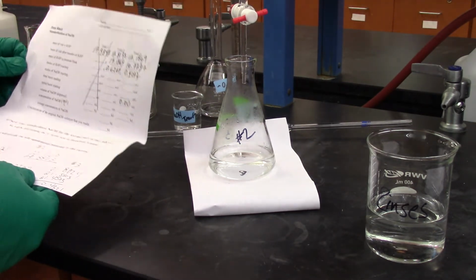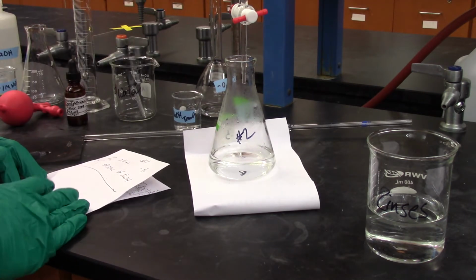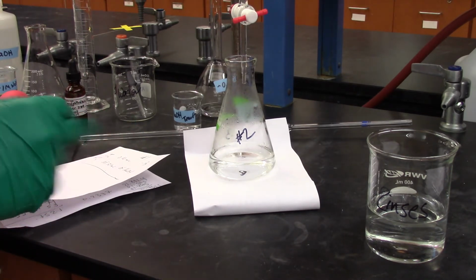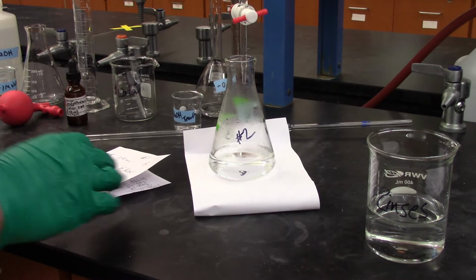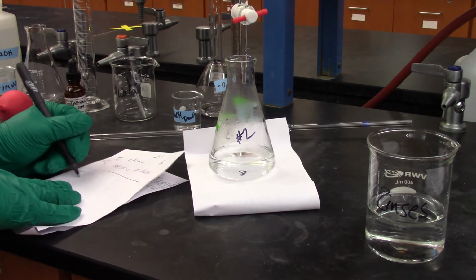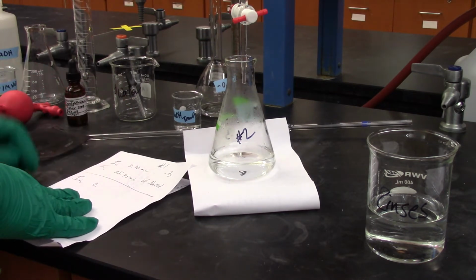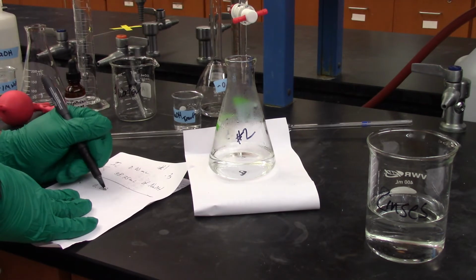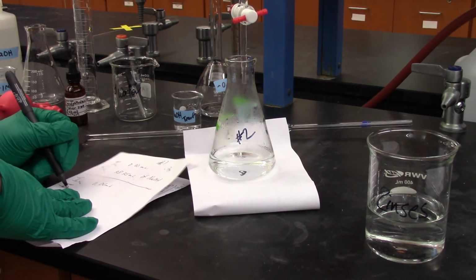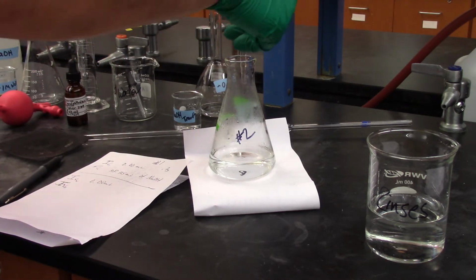So this next one, number 2, I actually have about 1/3 of that. I would guess that this would probably turn around 12 to 15 mils. There's only 0.23 grams in this, so I suspect that I'll use about 1/3. So I'd say about 12 mils. Let's see if I can predict that. My final volume, I'm going to say it's about 12. So let's see here.